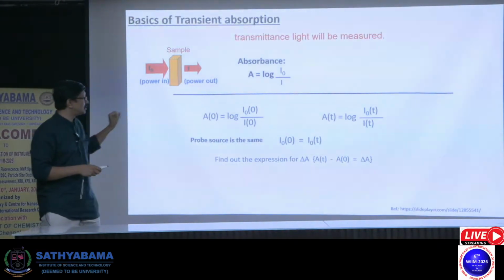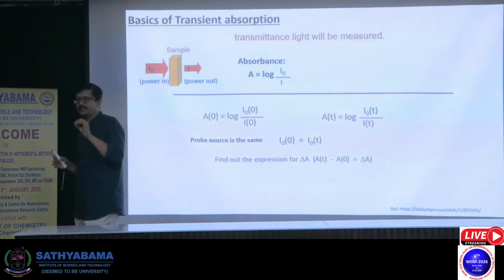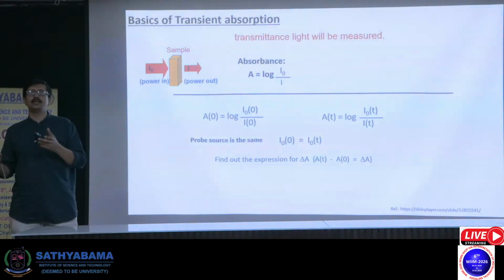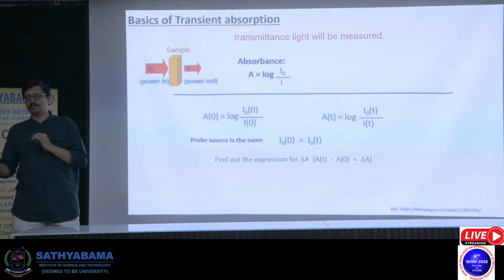So we don't have time to discuss in detail, but those who are interested in measuring the excited state absorption, you can see how to use this pump-probe technique to monitor your excited state absorption.